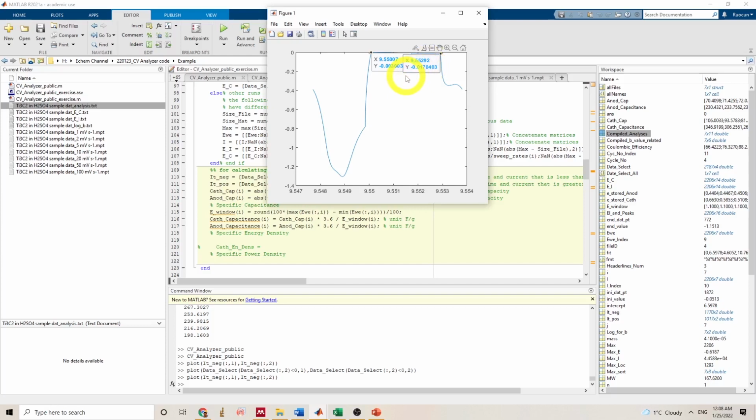All I need to do is find these two data points, and all these data points are continuous, so it will be data point 1, 2, 3, 4, 5, and let's say this is 100, and it will jump from data point 100 to 200. The time data will jump significantly, whereas anywhere else on the curve it will be a linear change. So all we need to do is find this point, and we'll be good.